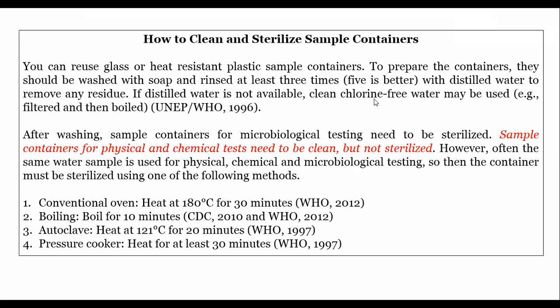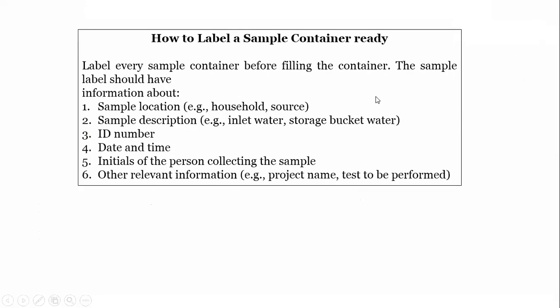So please, I will recommend that. Okay, so we have here how to label a sample container.